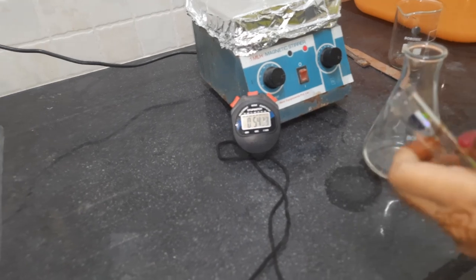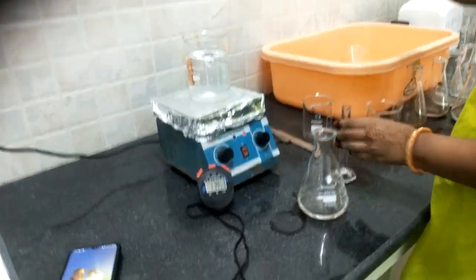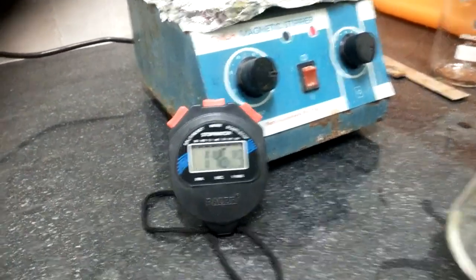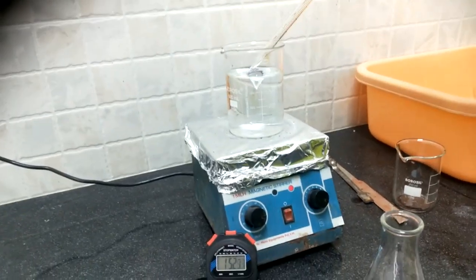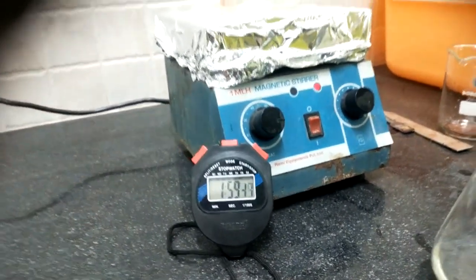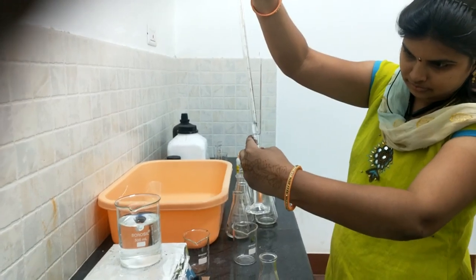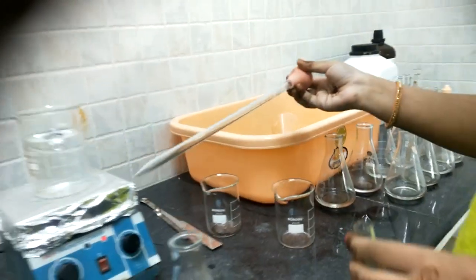So the time is now 52 seconds, 55, 56, 57. Wait for a minute, you are early. Now the second reading, I am taking 10 ml. This is 1, 2.